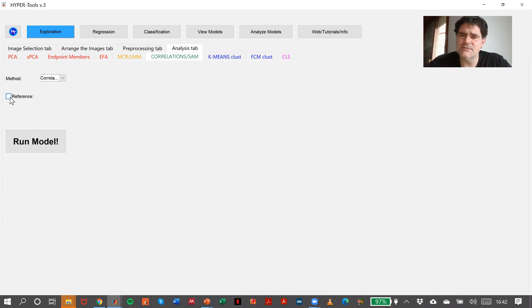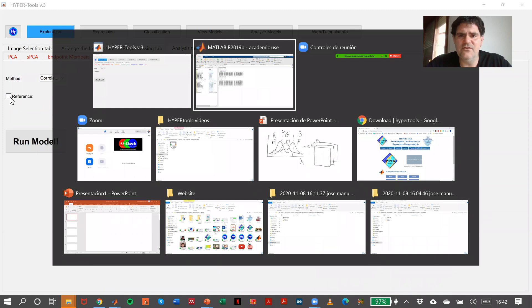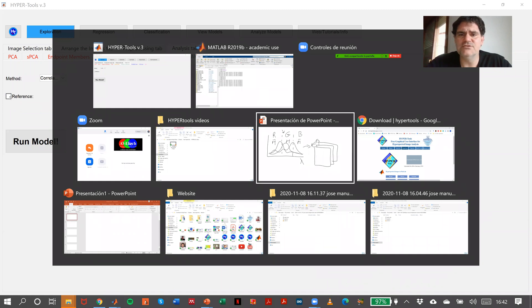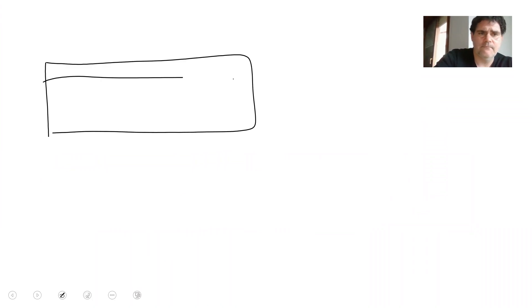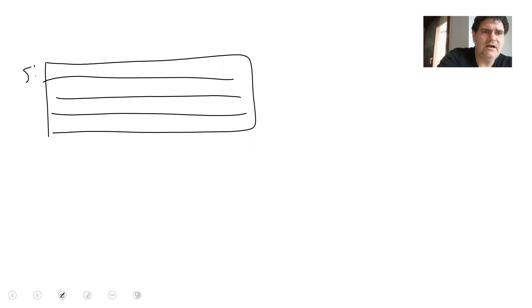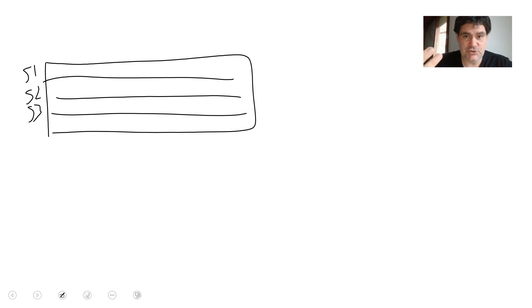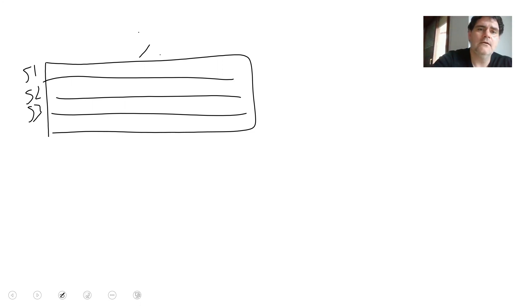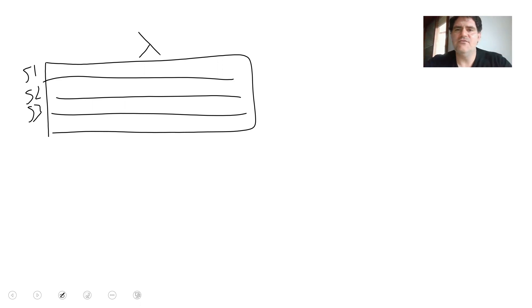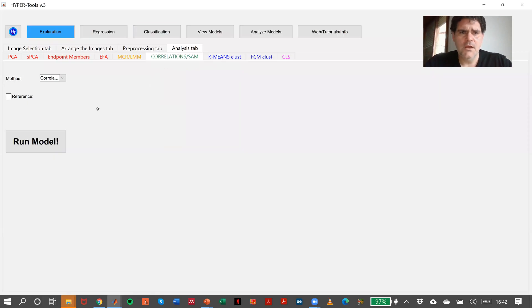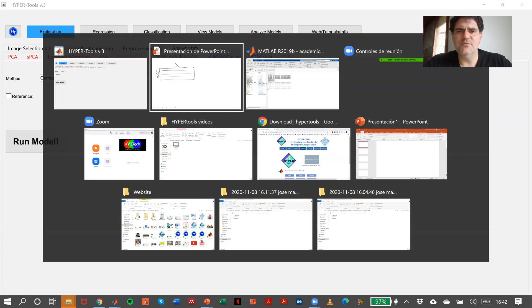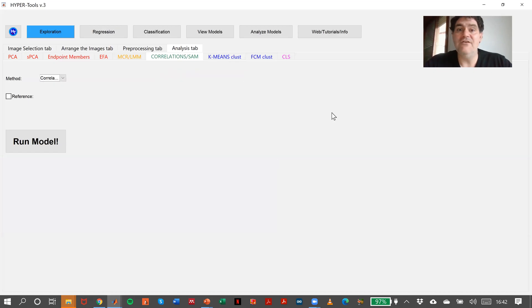The reference should be a matrix that is in our workspace, and this matrix needs to have the following shape. This is a matrix that contains as many spectra as we want, because what we want to do is to calculate the correlation between each one of these spectra and the image, and in the columns we have the wavelengths we need. So we need this information to be available in the workspace, but imagine that we don't have it.